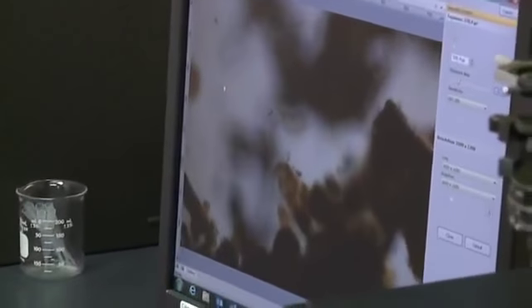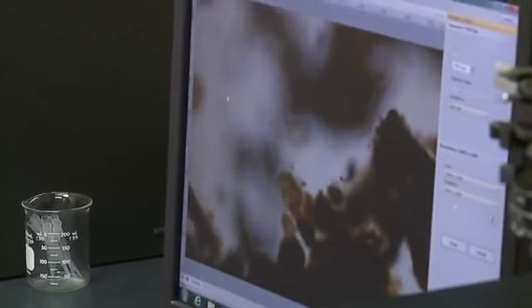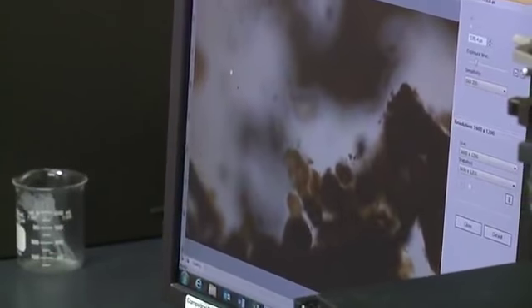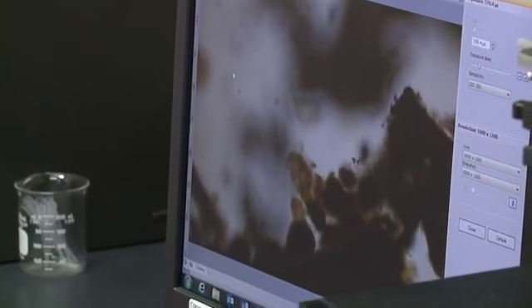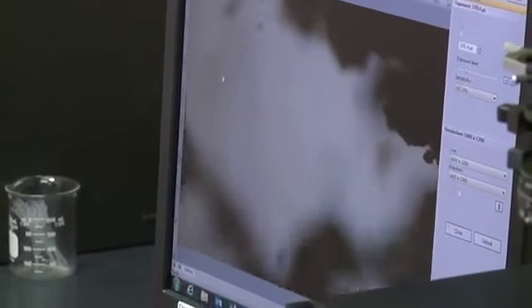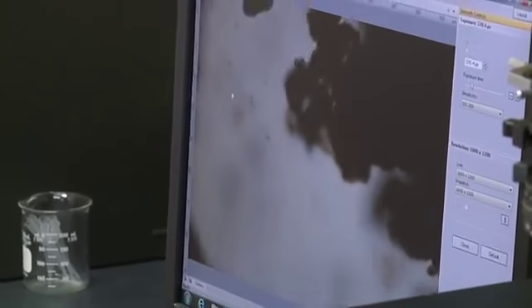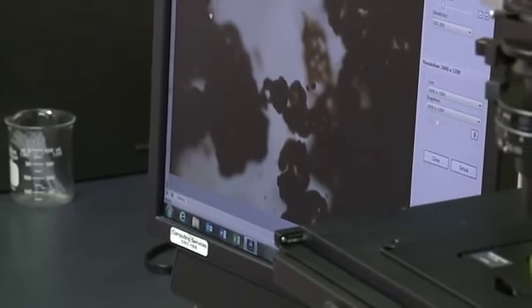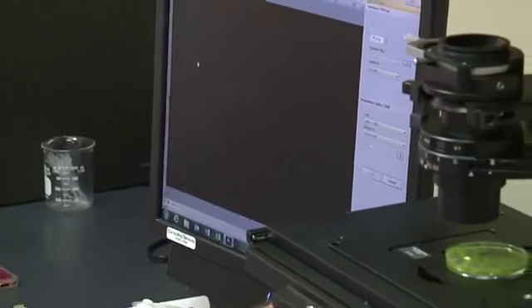Yeah, so I don't know if you can really see it on the screen here, but where you see the brown spots in here, that would be dying cyanobacteria cells. There was something that was just swimming by, so there are going to be little microscopic animals in here and things like that too.